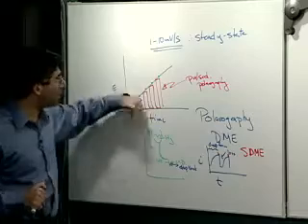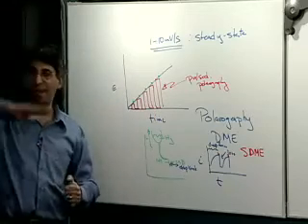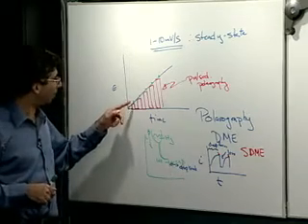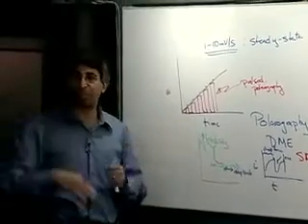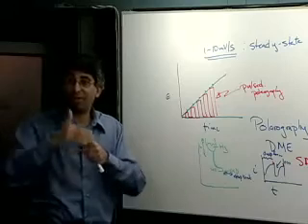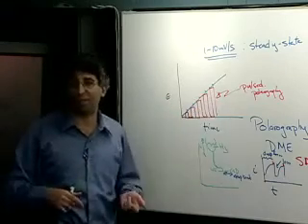because I'm breaking down the mercury drop when it falls off, stirs up the electrolyte. I'm breaking down the diffusion layer as the drop falls off, and I don't have a potential there because I have an off potential to reestablish it. So I see the initial current, which is a much larger current than the diffusion limited current at each of these pulses. And so I gain sensitivity by doing this.